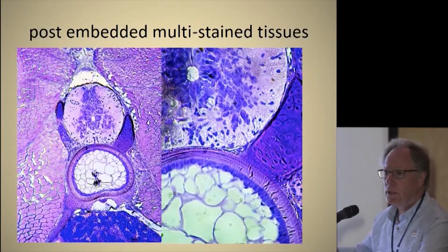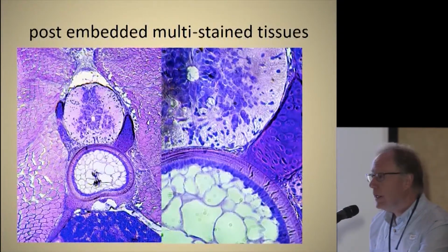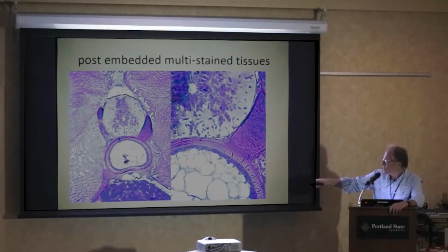This is the same, again, maybe 3 or 4 sections in, taken at about 50 micron. Now you're starting to see a big distinction between, this is muscle, which is all mesodermally derived. There's the notochord, which is mesodermally derived. This is cartilage, which is a combination of mesodermally derived tissue here, and it's beginning to ossify, I think, here.